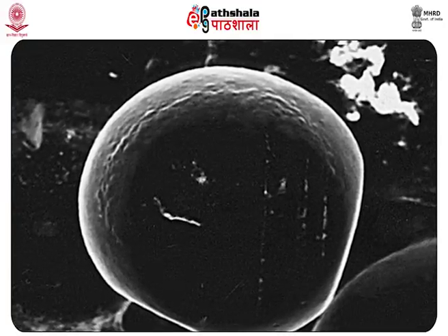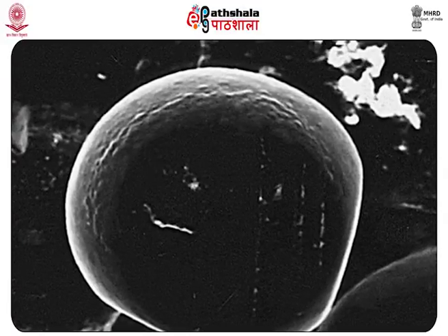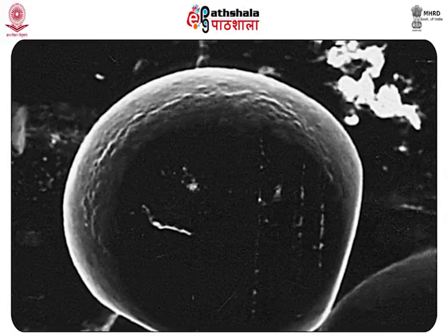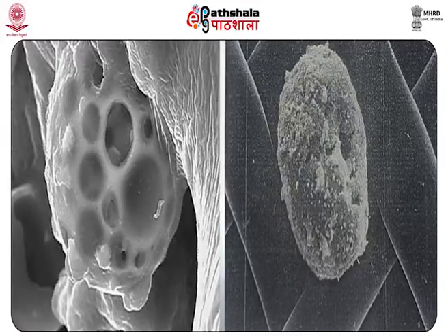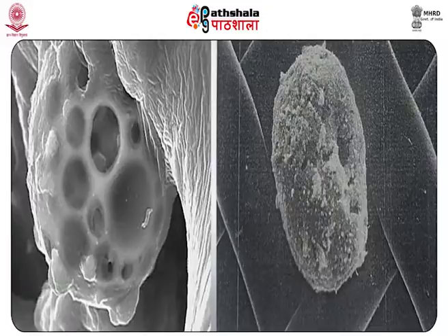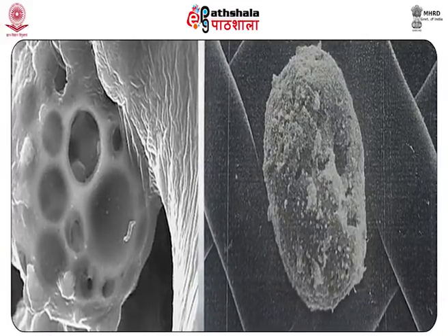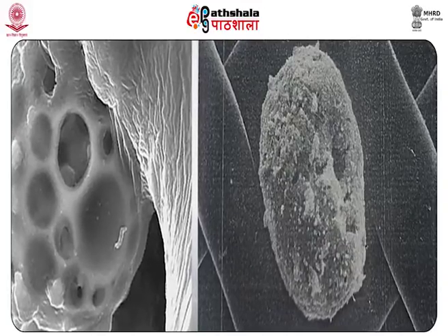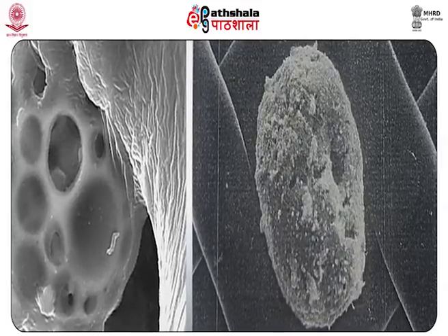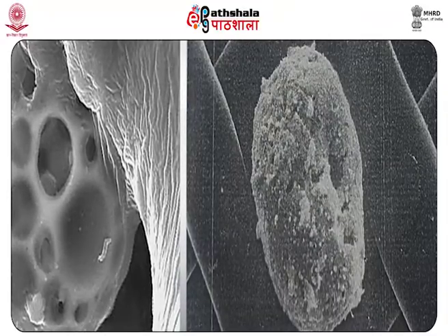These X-rays are passed into a detector where they are converted into electrical signals. These signals are sorted and displayed according to the energies of the emitted X-rays. Through the use of this technique, the elements lead, antimony, and barium, frequently found in most primers, can be rapidly detected and identified.